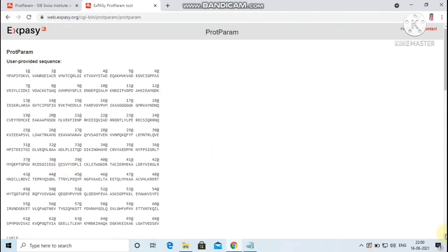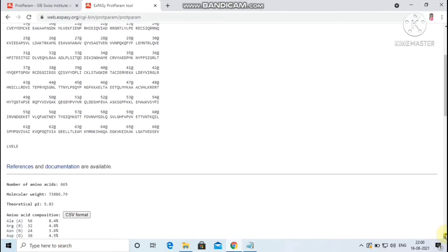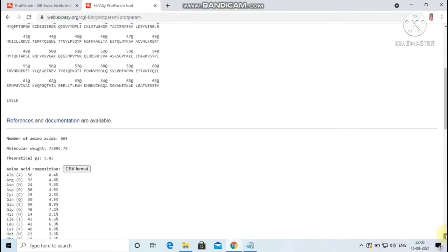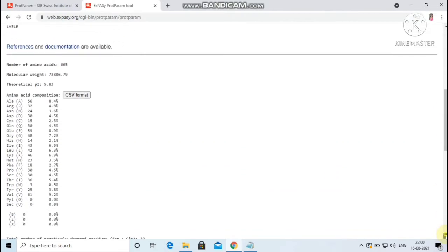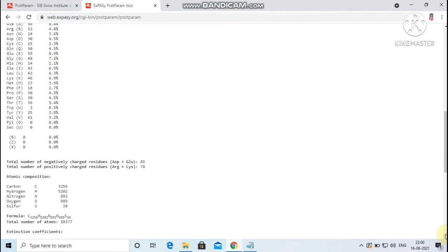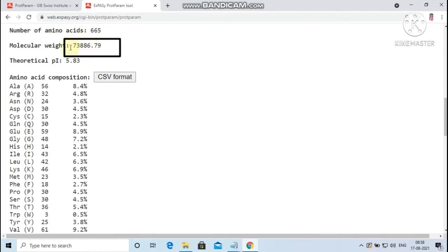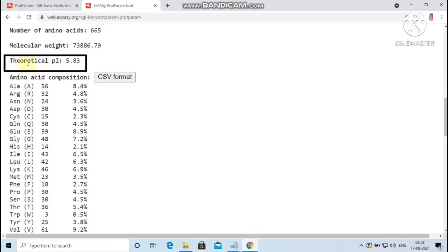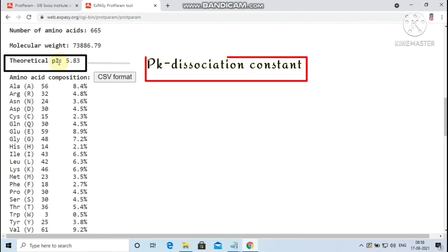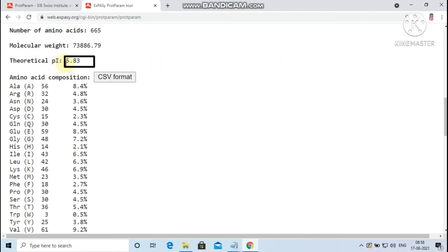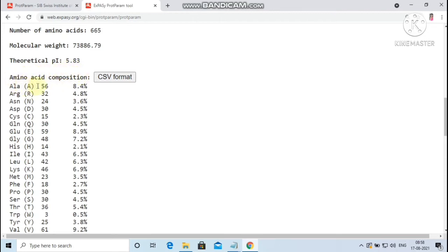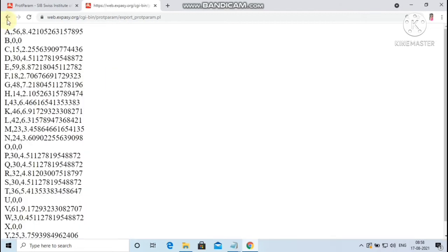You will be directed to the output or the result page. Here the physicochemical properties were computed. Let me analyze the resultant parameters. The number of amino acids present in the given protein is 665. The molecular weight of the protein carboxylase is 73,886.79 which is expressed in Daltons. The theoretical pI is calculated using pKa, that is a dissociation constant values of amino acid. Here the theoretical pI is 5.83, which is less than 7. This indicates that the protein is acidic in nature. Next, the amino acid composition is displayed as one-letter code followed by number of residues followed by frequency of residues. Amino acid composition is also available in CSV format.